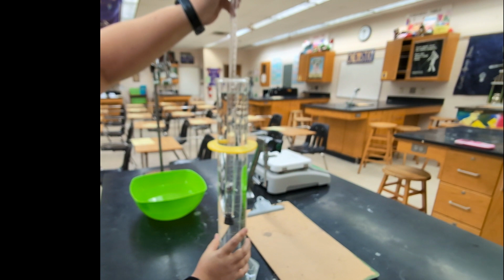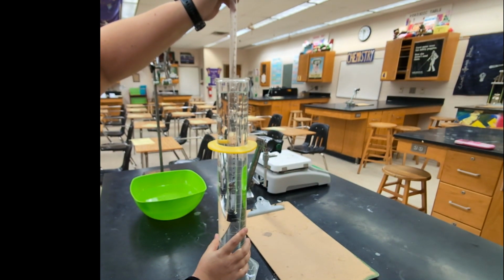And I'm measuring a volume of, looks like 31.9 milliliters, maybe 31.95 milliliters when those water levels are equal.